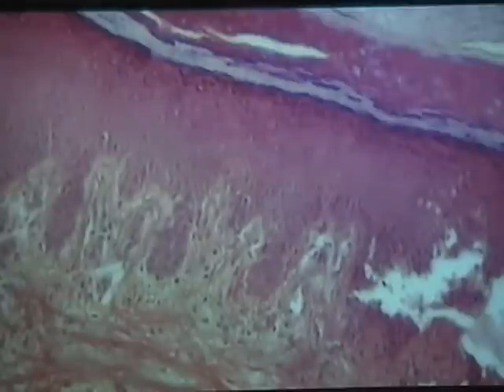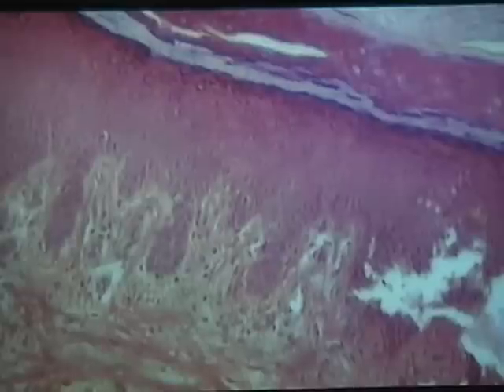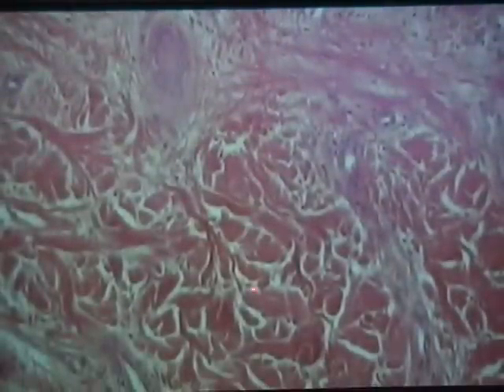But people, these tissues all come from organs. And so this is a slide of the skin. As such, we can use this slide to see not only keratinized stratified squamous epithelial tissue because it forms the epidermis of the skin, but we can use this same slide, and in fact, your notes and supplemental documents will refer you to this same slide for one of the connective tissues. This interface that I've mentioned is actually between the epidermis and the dermis, or between the overlying epithelial tissue and the underlying connective tissue. When we get down here, we're in the dermis of the skin.